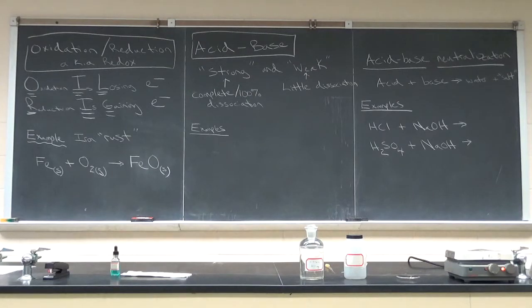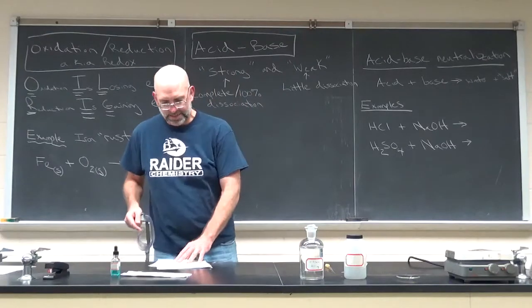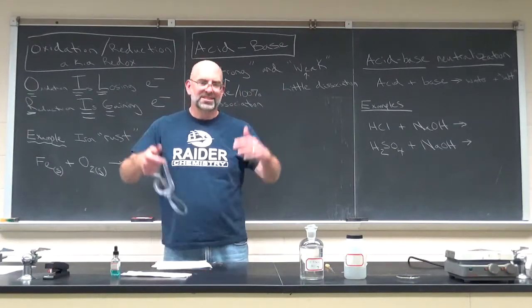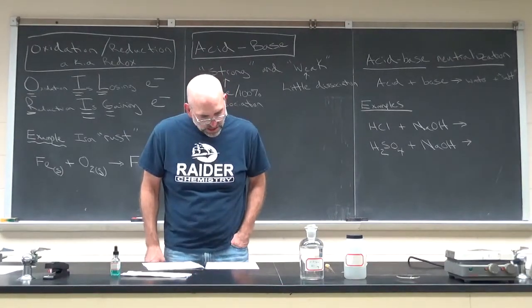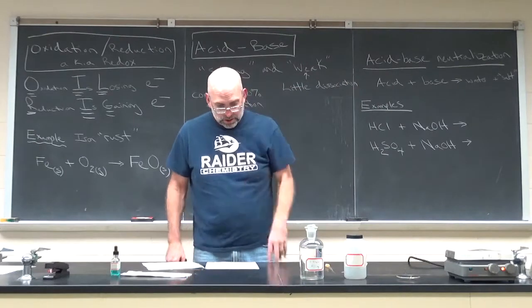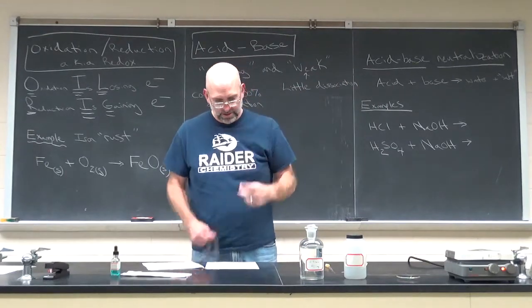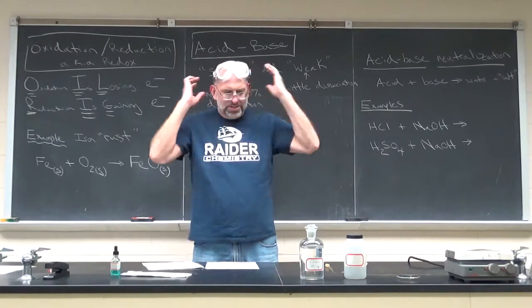For this one, I'm definitely going to be wearing some goggles, and I'm going to be bouncing around a little bit in the procedure. So I'm not just going to go one to the other because of time. The first one I'm going to do is under acid-base reactions on page 2, procedure number 1. I'm doing this as a demo, and I'll describe what's happening.